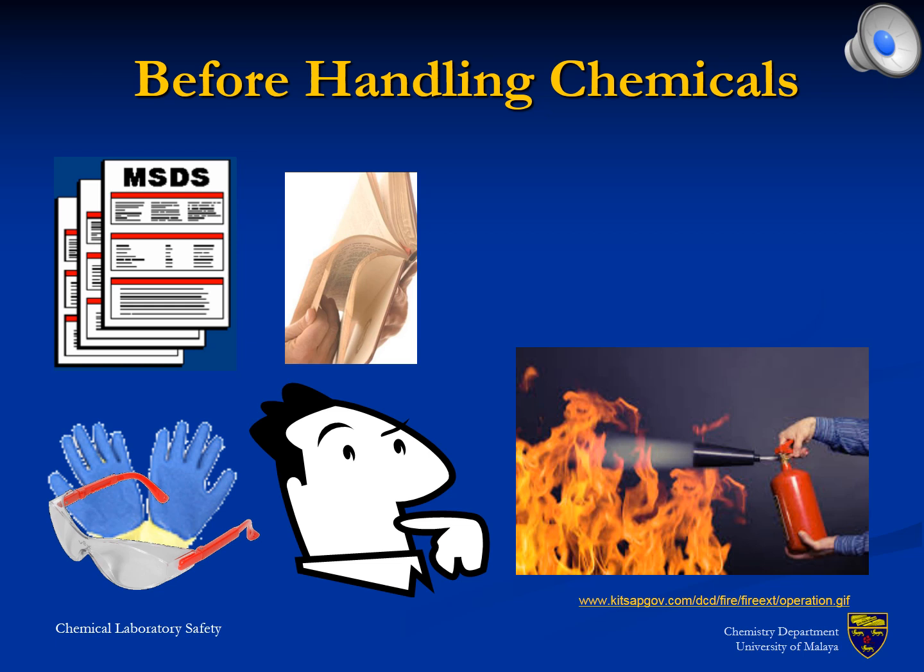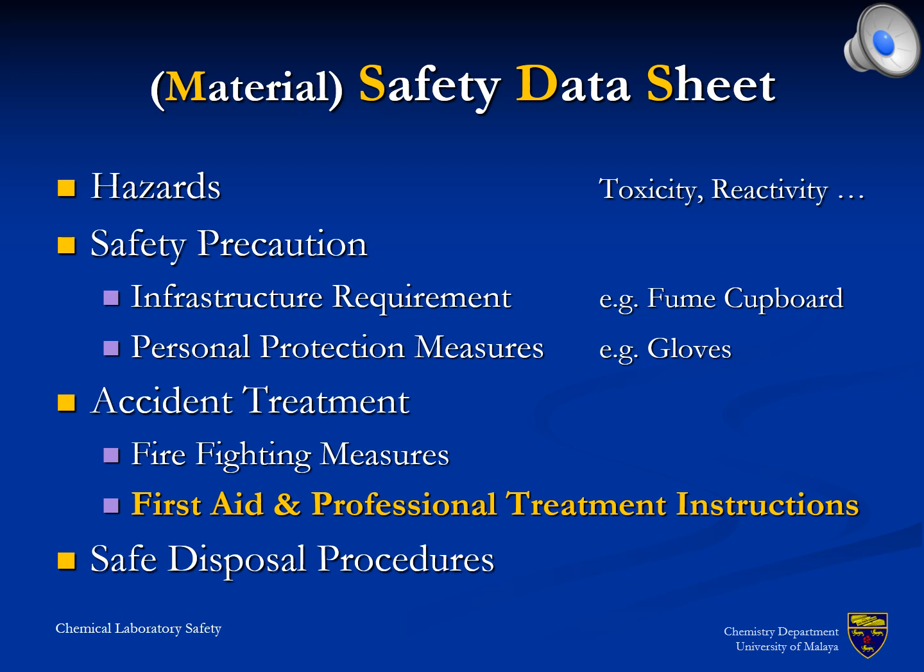Preparation for experiments inside a chemical laboratory involves not only the procedures, but also consideration of possible accidents and planning of a response for the latter. Most importantly, the hazards of the chemicals, which shall be used, need to be studied prior to any operation in the lab. Information can be obtained from so-called material safety data sheets. The documents provide information regarding potential hazards as well as instructions for safe operation and emergency response measures.